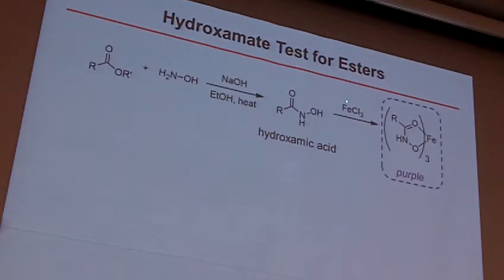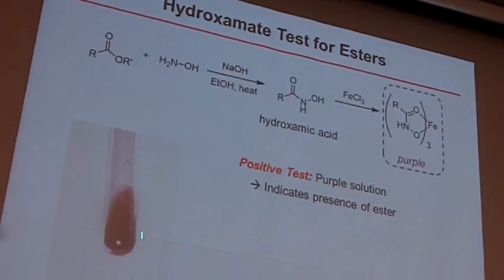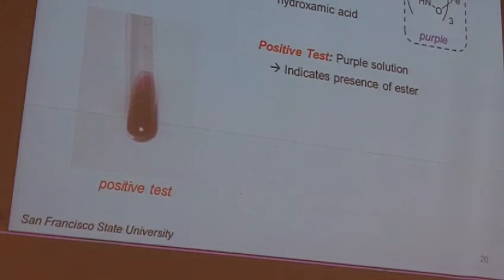So when we add this ferric chloride, which is a yellowish color, it will give us a pretty significant purple color, and we get a positive solution. Here's an example of a test tube on its side, so you can see it's purple. Enough purple and it looks almost black, but you see a definite purple solution when you run this test. And again, that gets you down to the ester, with that functional group there.